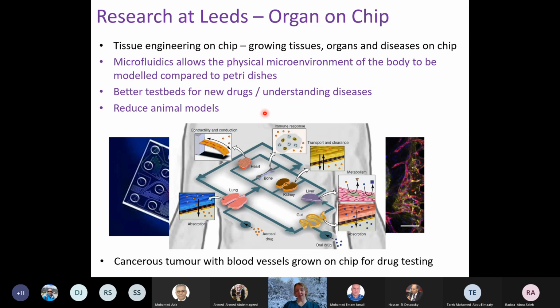So when you're doing toxicity assays, say you're applying a chemotherapy agent to a tumor in one area of your chip, you can have a kidney or a liver model in another area, so you can directly see the effect it would have downstream on that organ, putting these drugs in the body. That's what everybody would like to get to: doing this organ on chip where you have all components of the human body on a single device in order to do your drug testing.